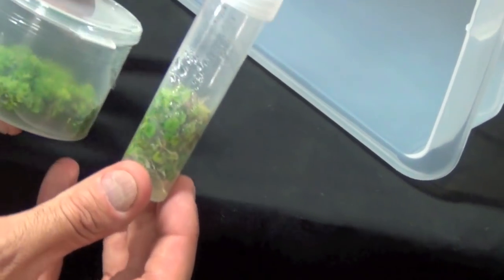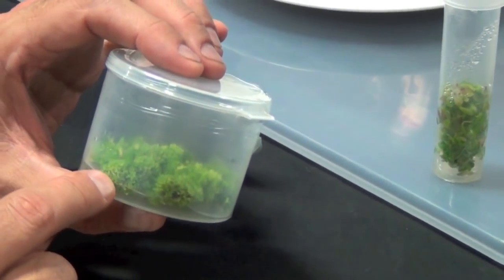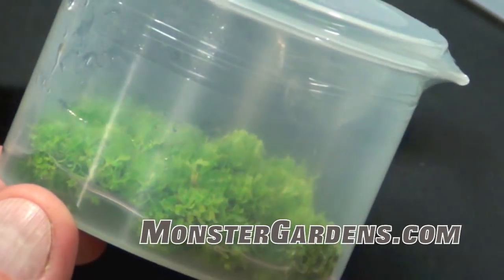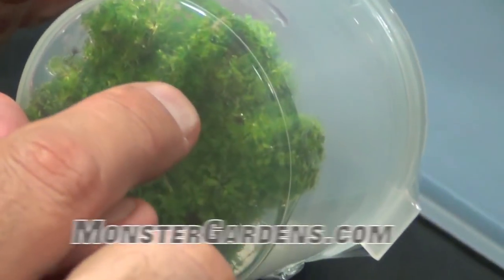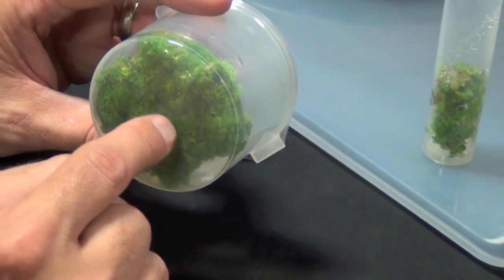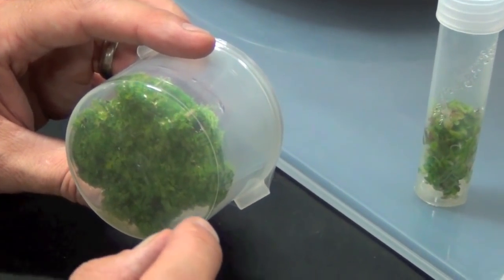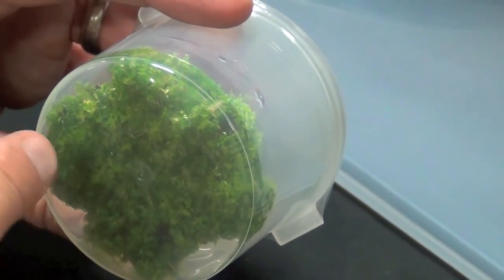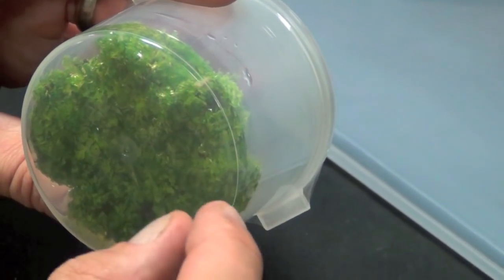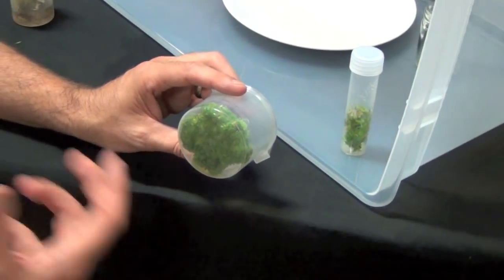I did the same kind of thing with ferns. These are from the tissue culture labs at Geopot — Geopot has a tissue culture lab for ferns, and I've taken their fern and introduced pieces into tissue culture of my own. These are the ferns it's produced. This is actually seven pieces all grown up big and thick — each one started as a little lump about the size of a pea of ferns, and this is what it's grown into. If I want to make another one of these, I need seven more pieces the size of peas. Everything else here can be taken out and planted into soil under a dome, and that's where it starts to become a bigger plant and where your new plants come from. Thirty days from now, those little pea-sized pieces are going to start getting about this big.